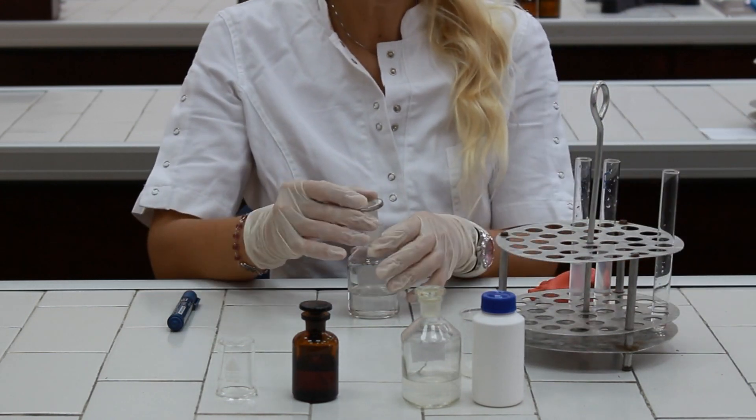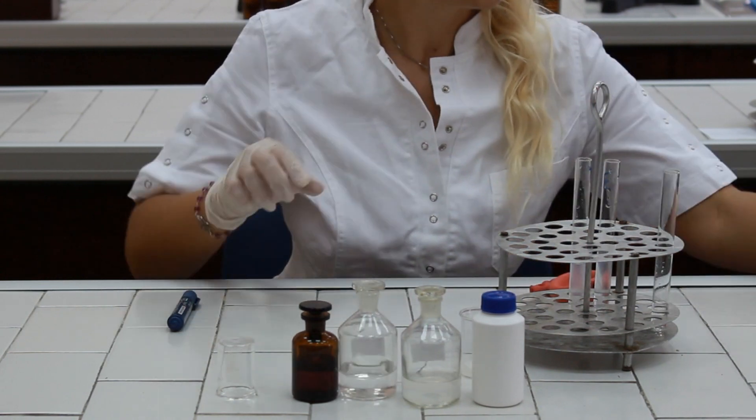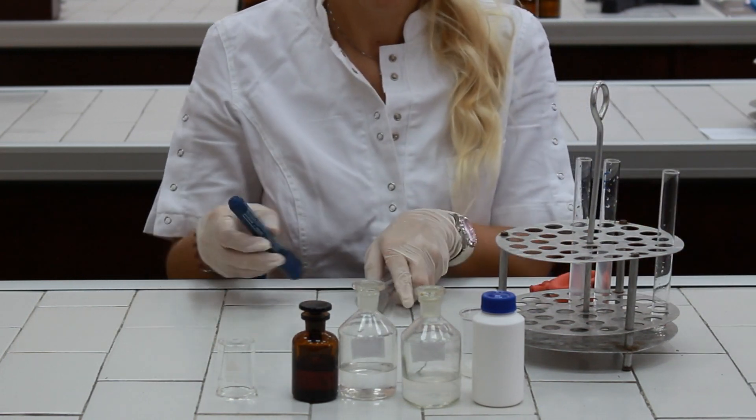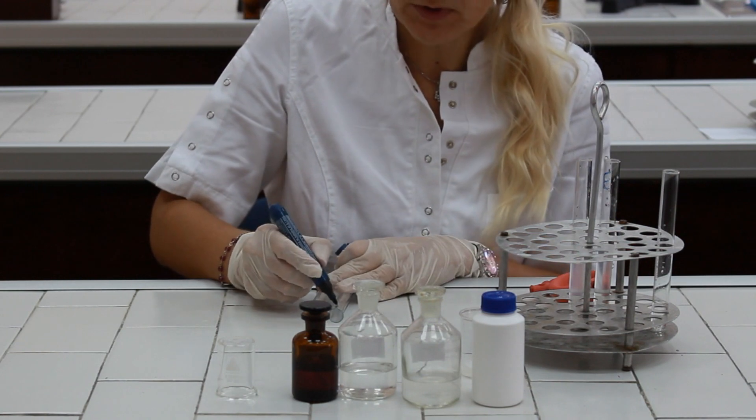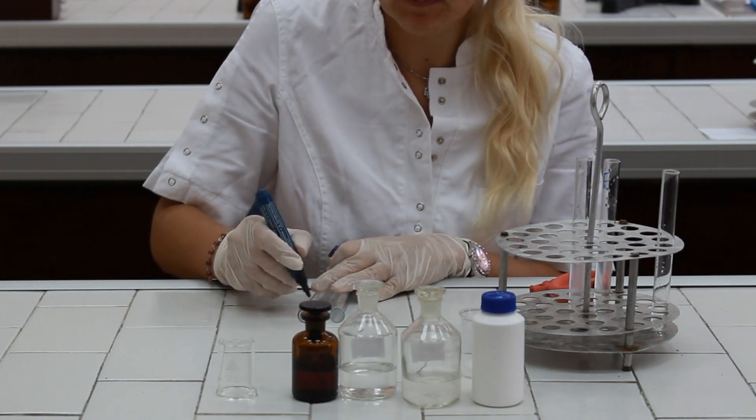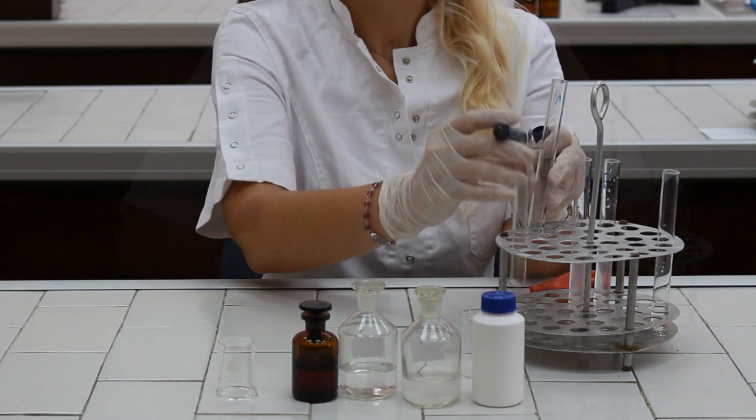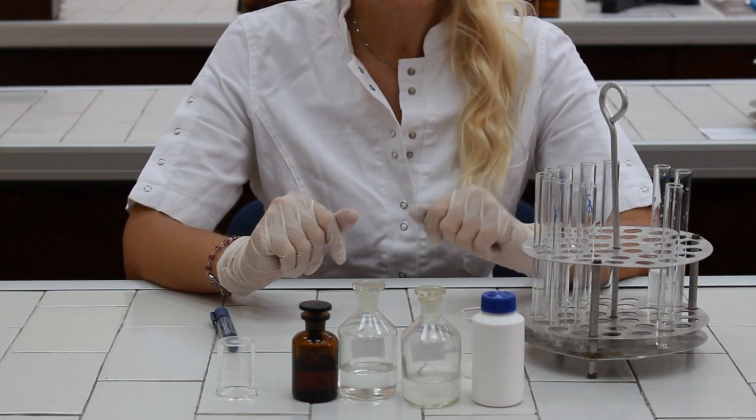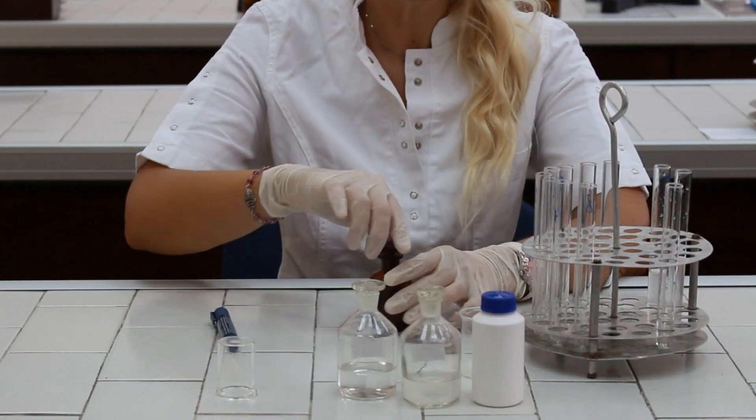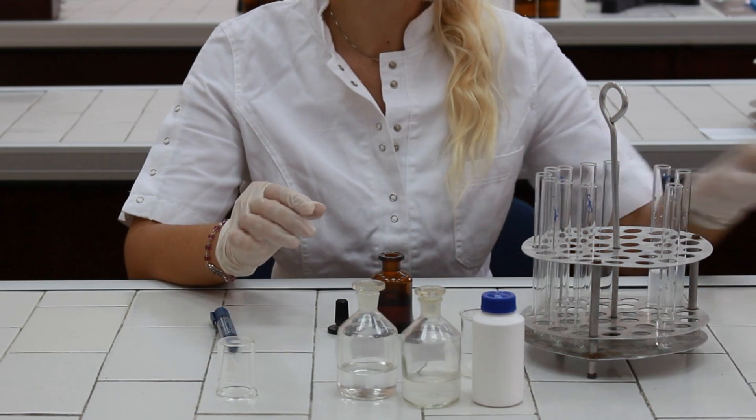Now, we need to take at least 9 test tubes and mark them with numbers from 1 to 9. In these 9 test tubes, we are going to pipette a few drops of iodine solution.